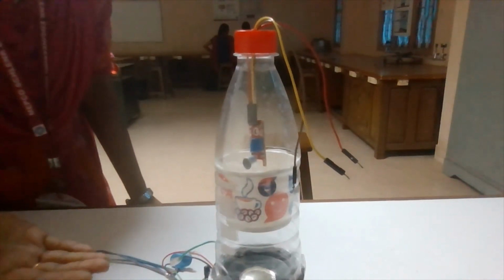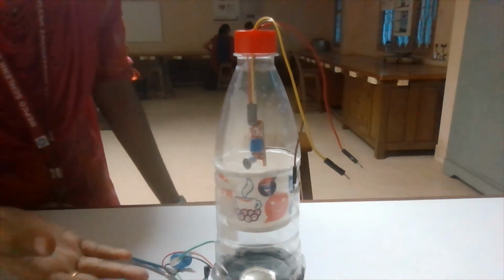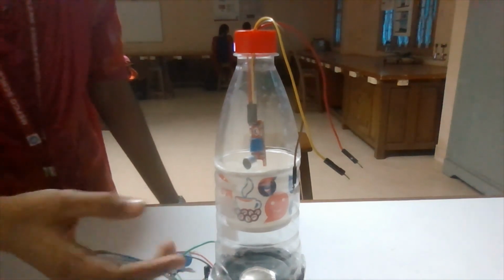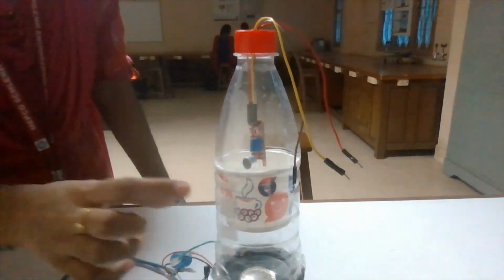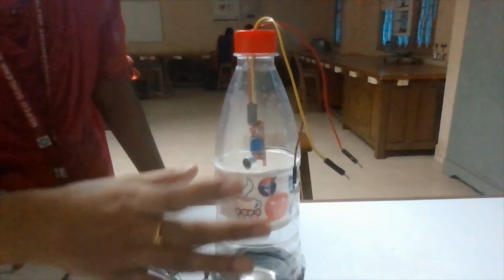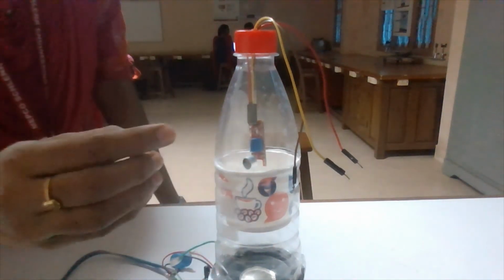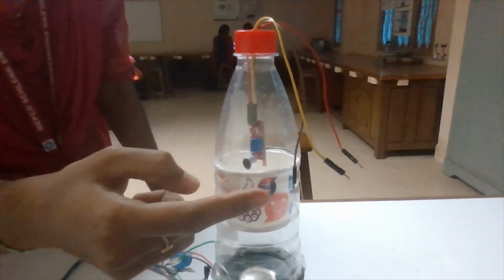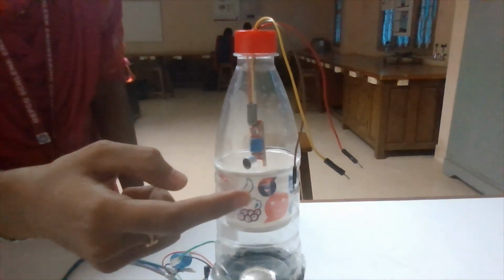This is the setup we have used for detecting the adulterants. Here we have generated sound using an online tone generator and passed it to a speaker, which travels through the sample placed in the paper cup, which is enclosed in a plastic container. The output of the sound is taken using the condenser microphone, and the output will be recorded by the oscilloscope, which is used for processing.